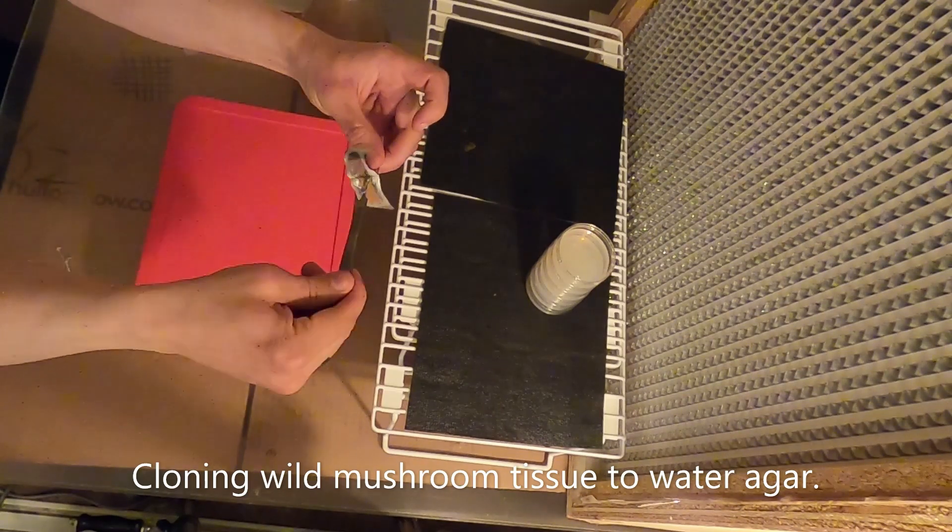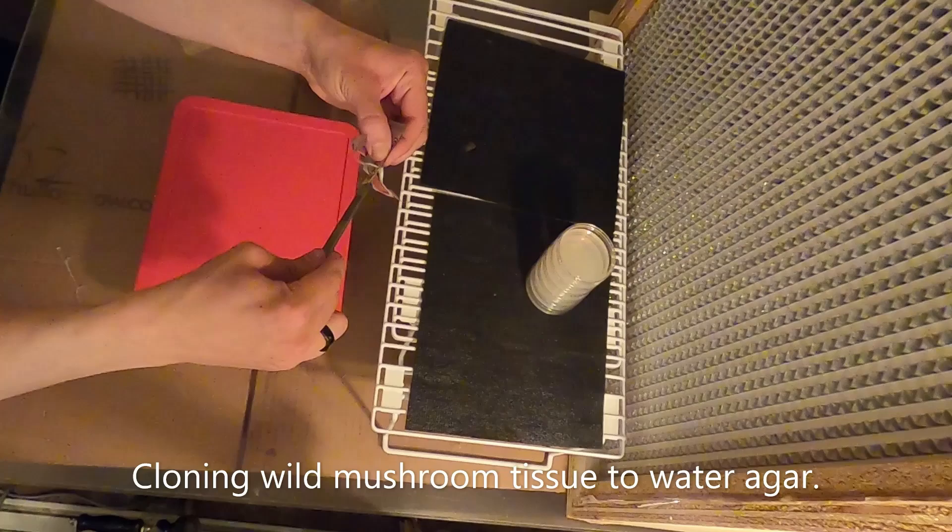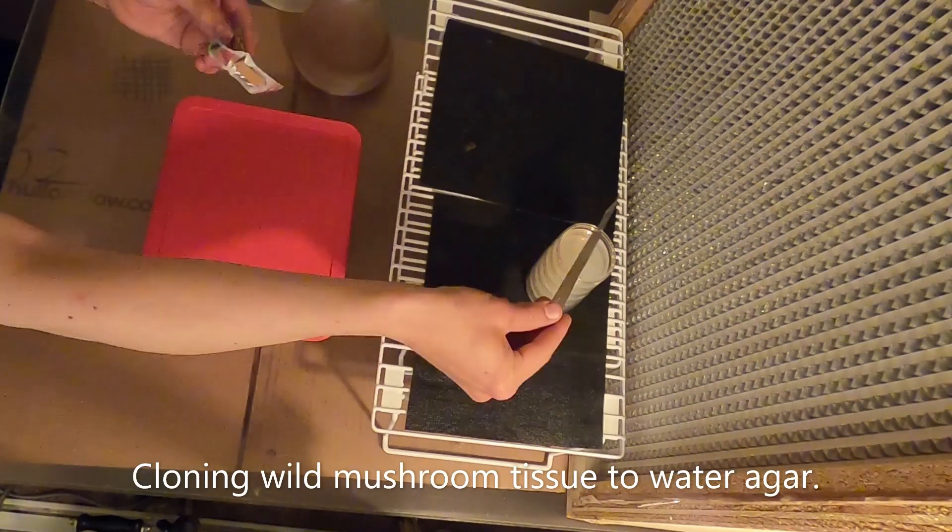We'll take that into the laboratory and put on a brand new clinic blade. I have several water agar plates ready on the flow hood.